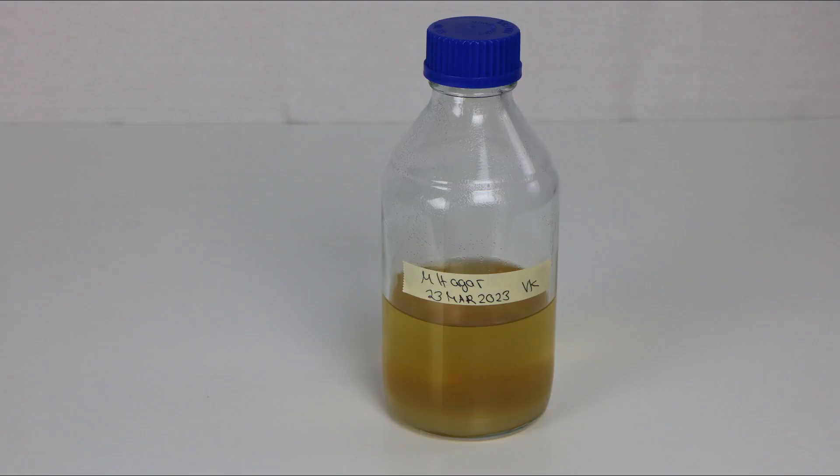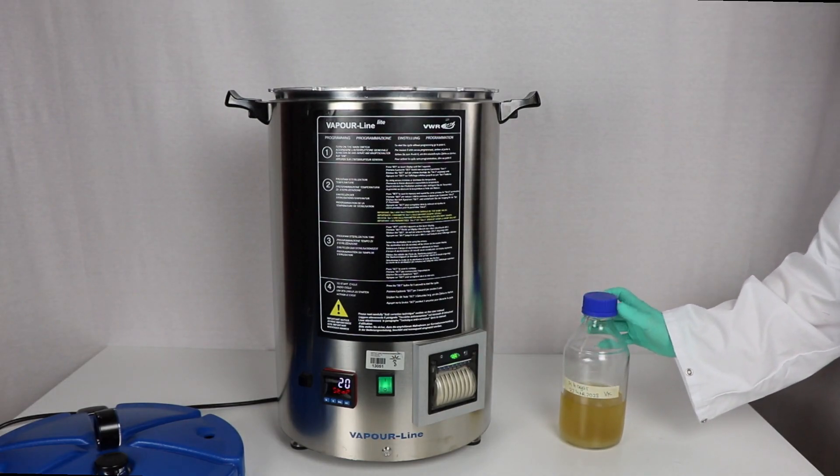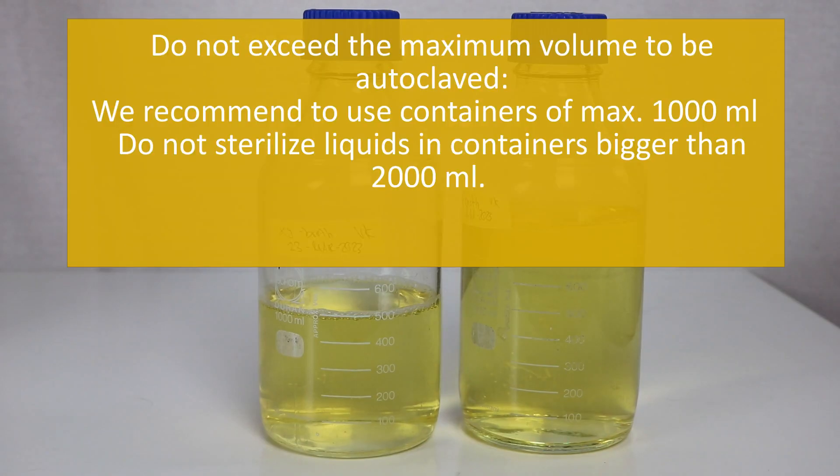Preparation of materials for sterilization: place the autoclave basket in the autoclave. Paste a piece of steam indicator tape onto each flask; you can use the indicator tape to label the flask with date, type of media, and initials. Place the material to be sterilized into the autoclave basket.